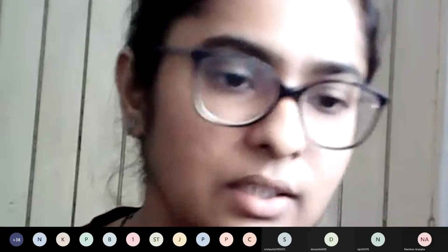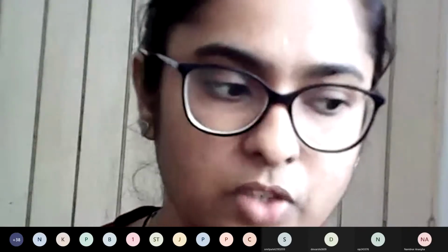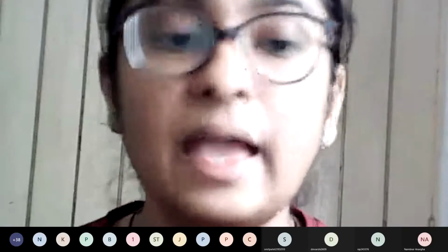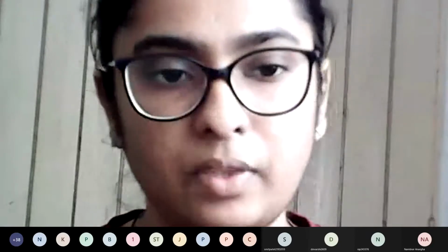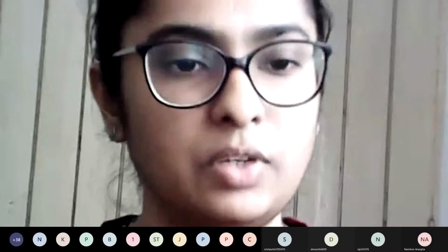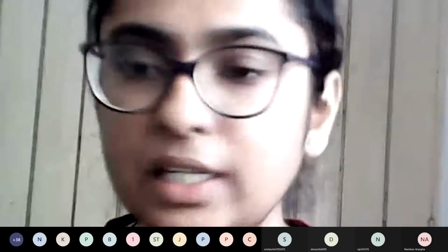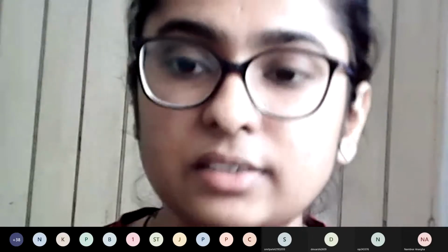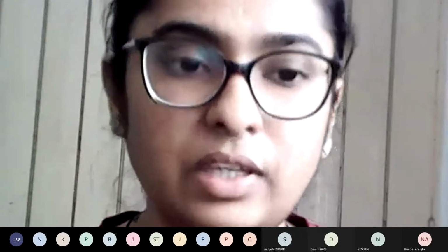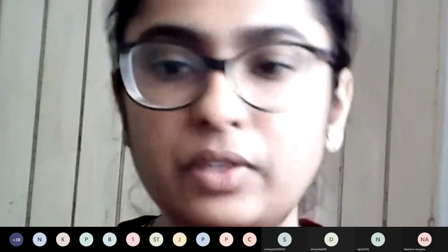You take all the ingredients, like all the reagents which you need for the titration, except your sample. Except the sample, everything else you take, do the titration, whatever reading you get is the blank reading, that becomes your first part. Then we go to the second part where we detect the amount of Fe present in the solution. Only Fe, exclusively Fe.